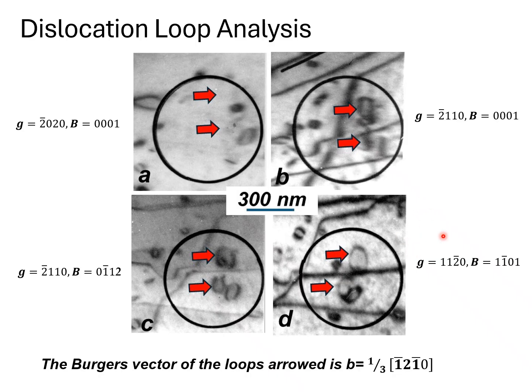And the outside contrast, I guess this shows outside contrast. Well, that's a different tilt as well. Sorry, no, this is a different tilt. I have a lot of other images for this case, but I can tell you that this is a vacancy loop.